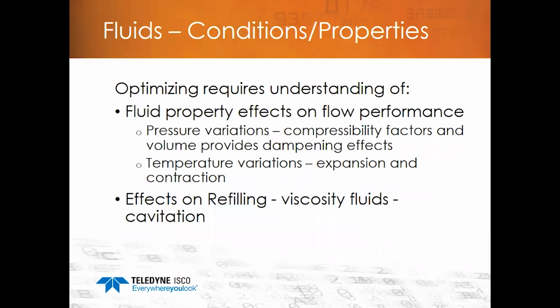Temperature variations expand and contract the fluid, thereby changing the flow rate. And also the effects of refilling from high viscosity fluids, which can create cavitation issues. If the pump can't be properly filled, then the initial flow rates are affected.